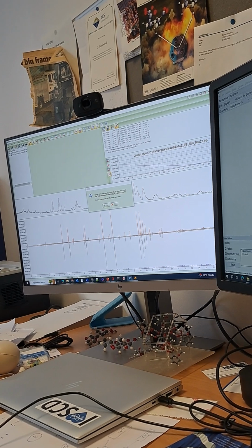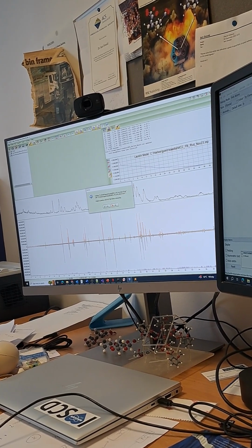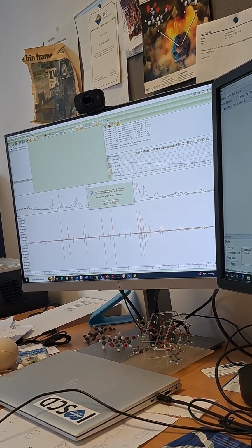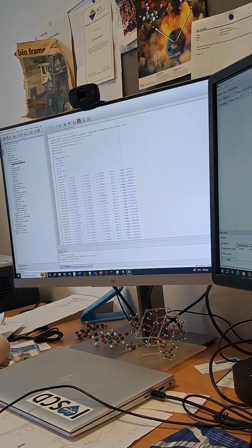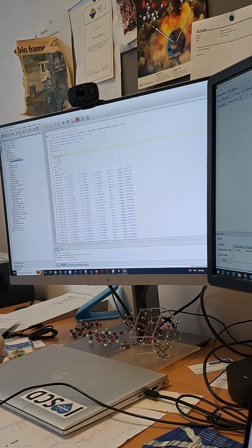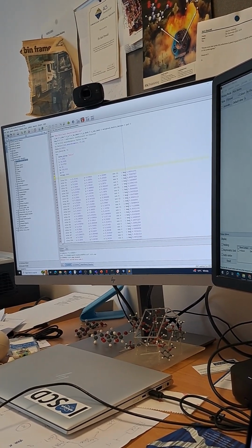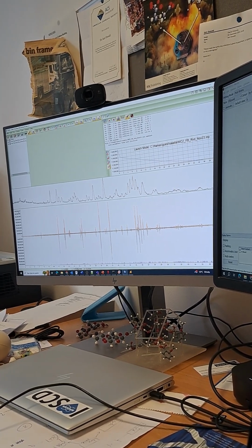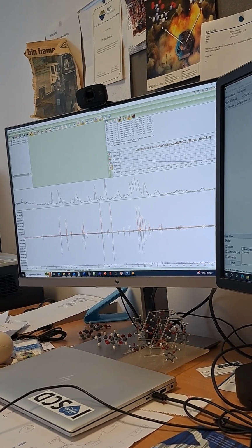So very quickly we're in this frame. It looks odd. There's one thing that I haven't done yet. Background, we've done the background. One thing we haven't done yet is we need to put a scale on this. What that means is that this intensity will have a certain intensity that it arrives at. It was saying the maximum intensity is at 450 million. That's just ridiculous. You're never going to get 450 million from a diffractometer.